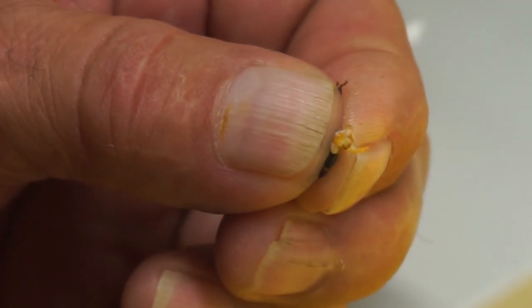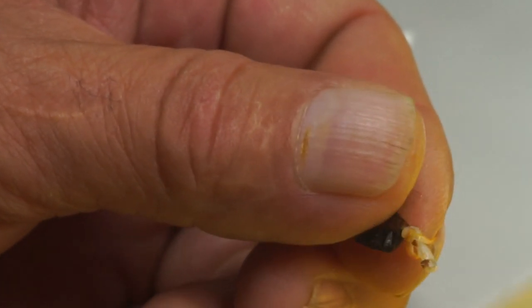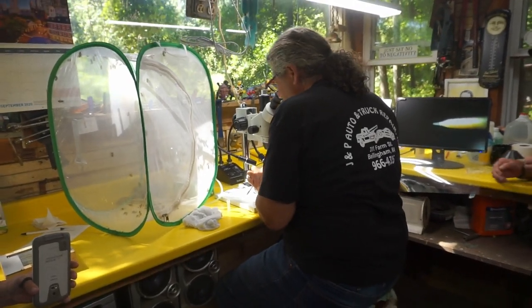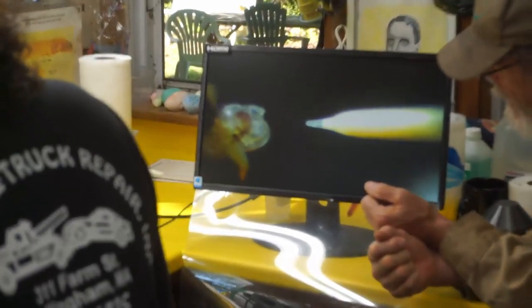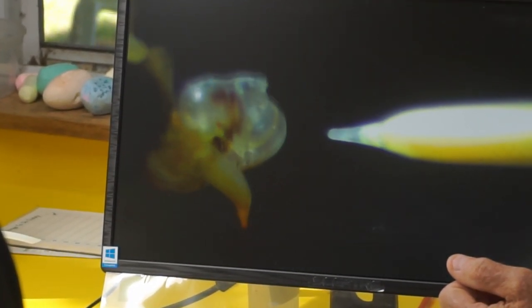Here, there we go. I don't know if there's a sperm in there. Wow. All right. This is something that has no sperm at all. Right? It's clear. See that? Yeah. So it's immature. So that was probably one that isn't... It's young. That's the one Bob took out of the cell.